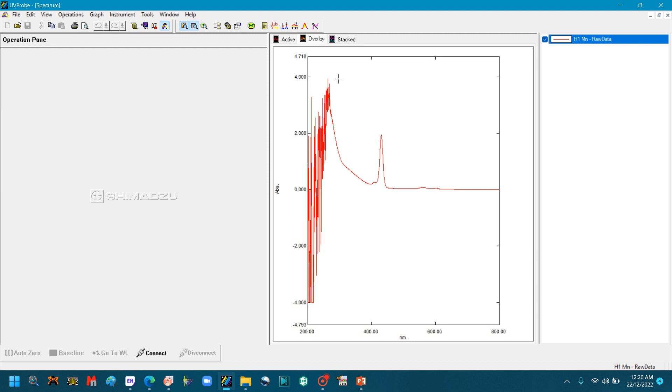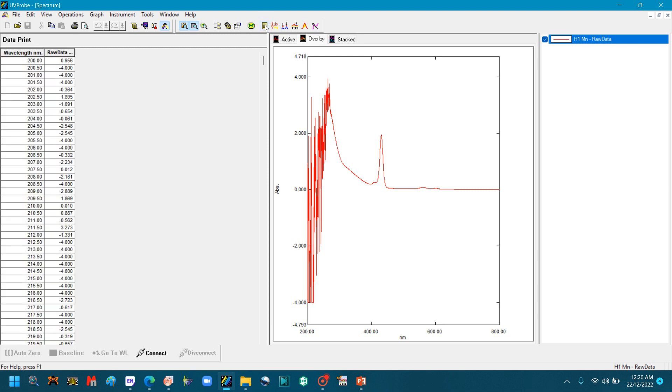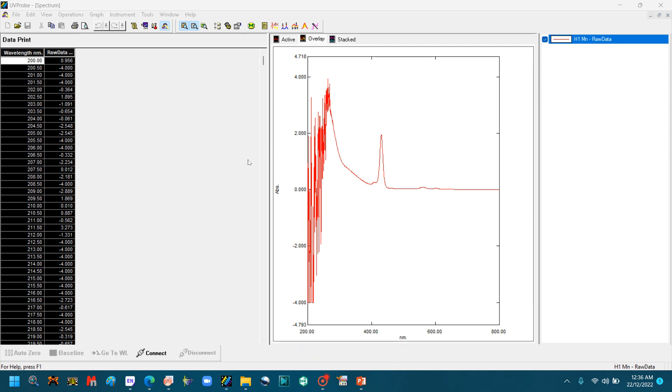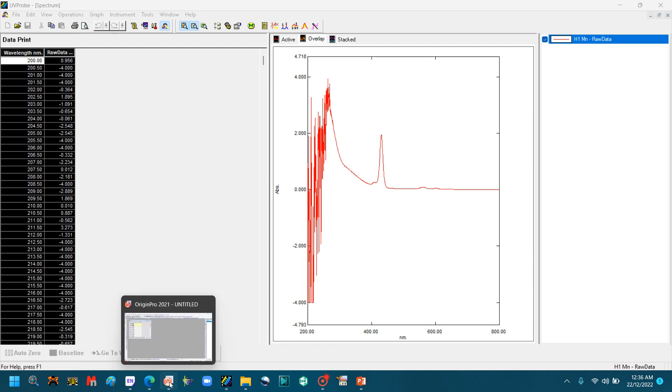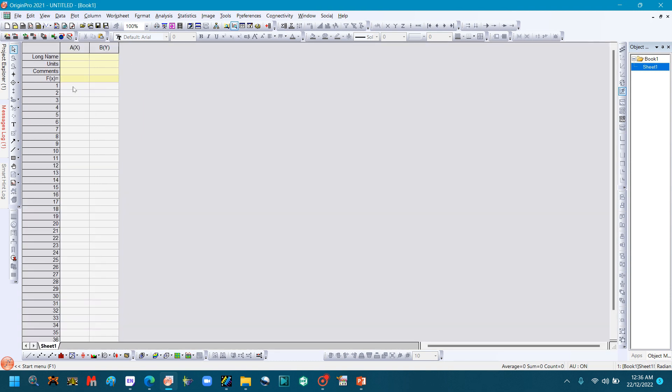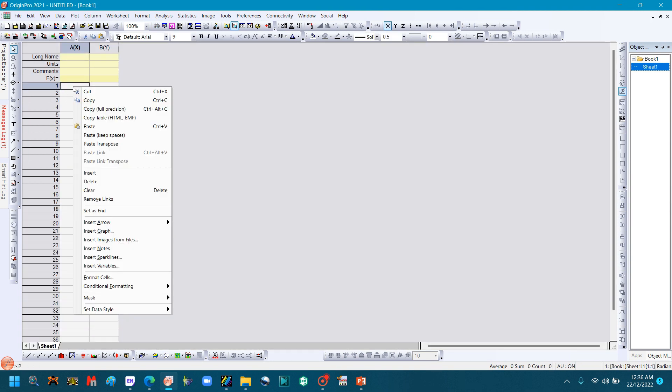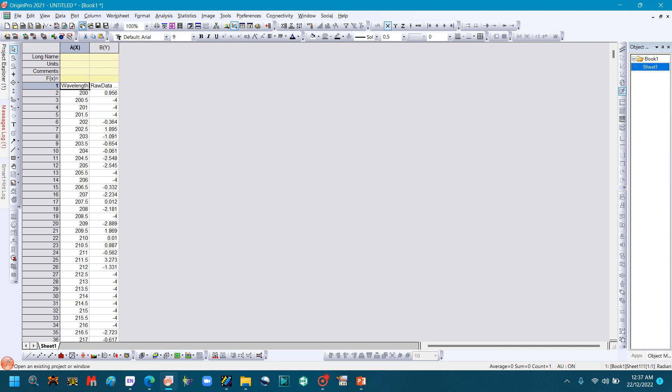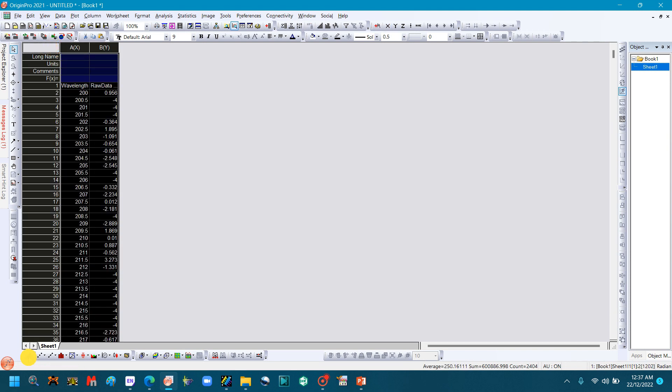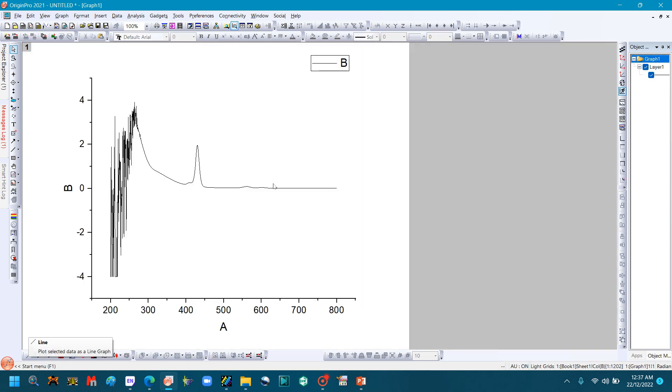You can see the file is open here. So we want its text file to draw a graph on the Origin software. We will open this text file by right-clicking. The log will be open. Click Select All, then right-click and click Copy. Now go to the Origin software, open it, paste the data here. Select both columns and plot the line graph.